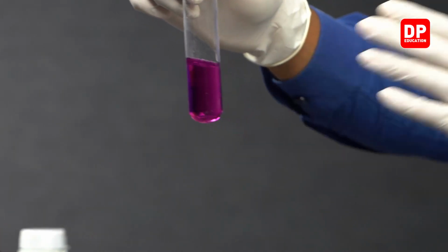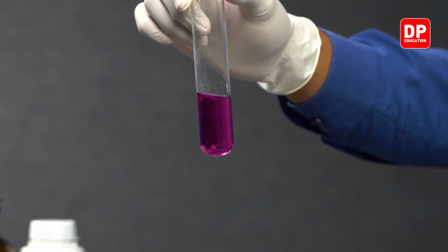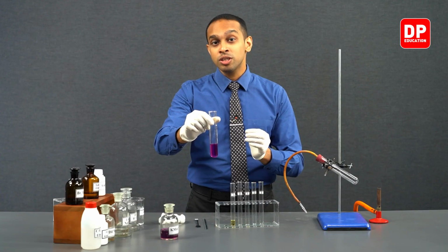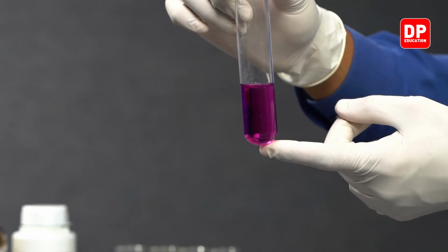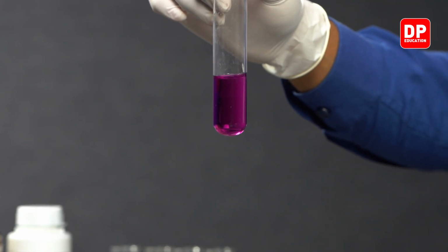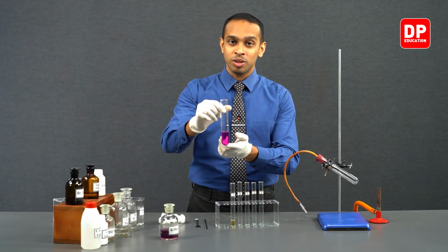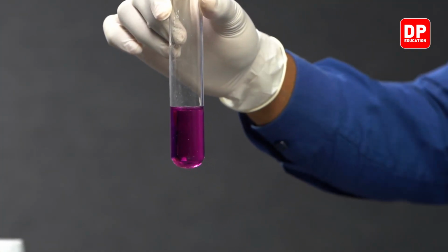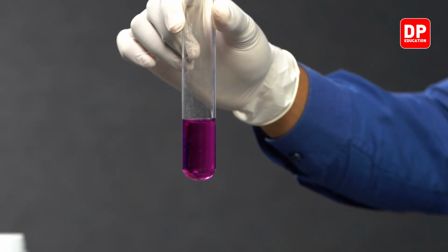We know that the potassium permanganate solution is a dilute solution because if you have conducted experiments with potassium permanganate, if you take concentrated potassium permanganate, it is going to have a very dark purple color. It's going to be a very deep purple color, somewhat different to the light purple color that you observe here. So what we have here is a dilute alkaline potassium permanganate solution.